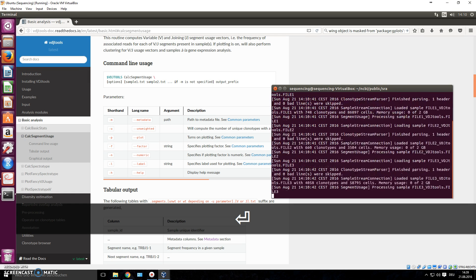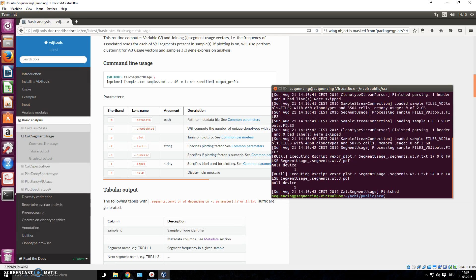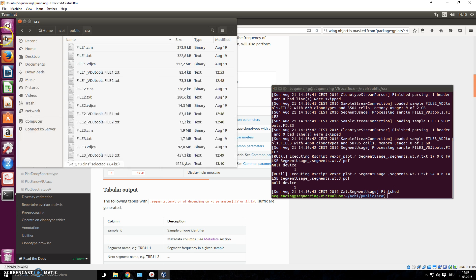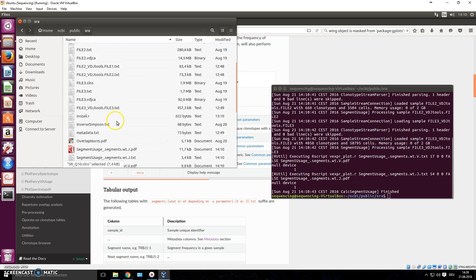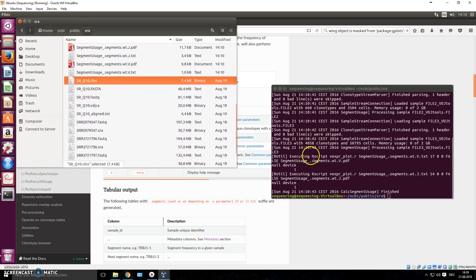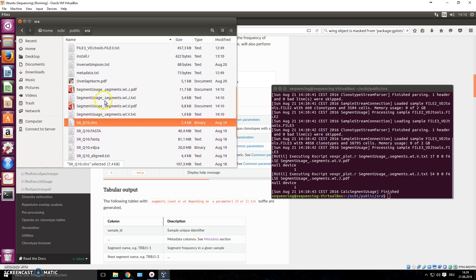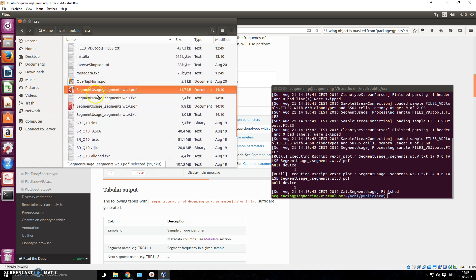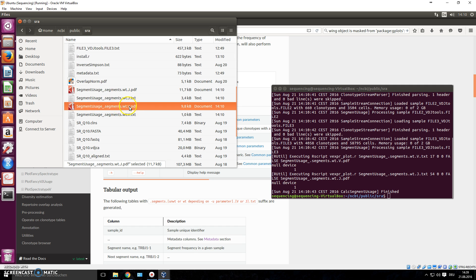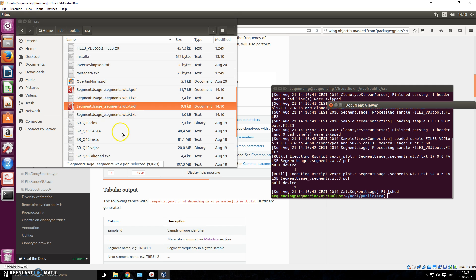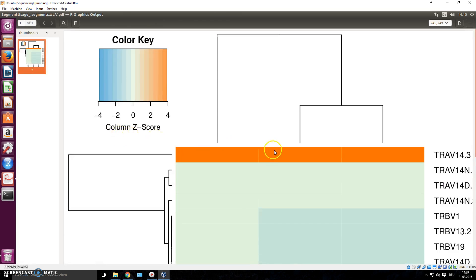It finished. We now have these files in the folder where we executed the command — PDF files with the J and variable regions plotted in this graph.